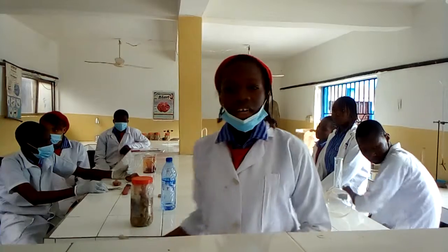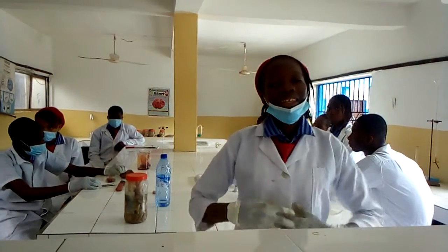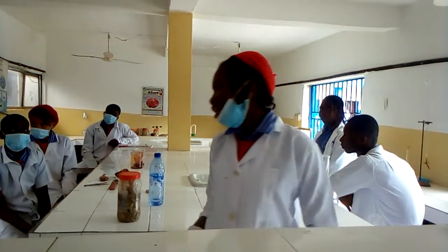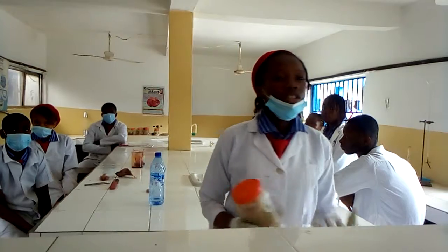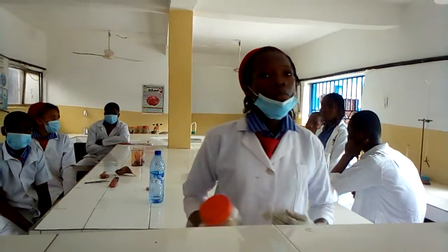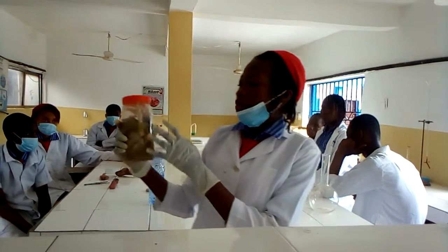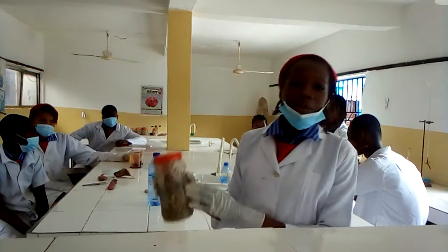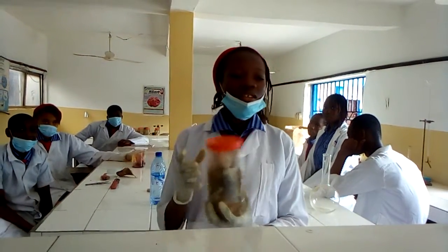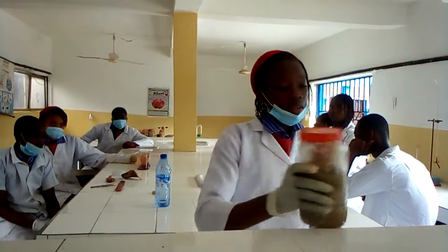After the practical, to preserve the internal organs of the animal which we removed from the dissection process, we use formalin, which is a chemical used in preserving dead organisms or bodies, in order to prevent smell or decay. Here we have the practical we just concluded with the formalin in it to preserve it. With this, it can stay for years without getting a sticky odor or decay.